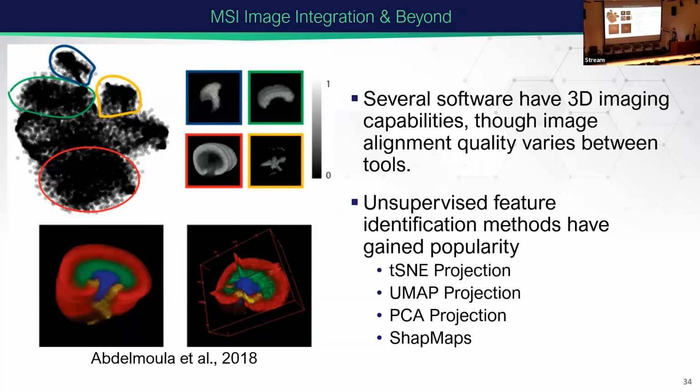When it comes to segmentation, here are just 4 approaches that I found, but if you Google segmentation approaches that are being developed, not just for mass spec imaging, but through Google and Microsoft, there are over 40 algorithms that I was able to pick up and list by hand before I got tired. So there are a lot of options out there for segmentation and for detecting features of each of these tissues.